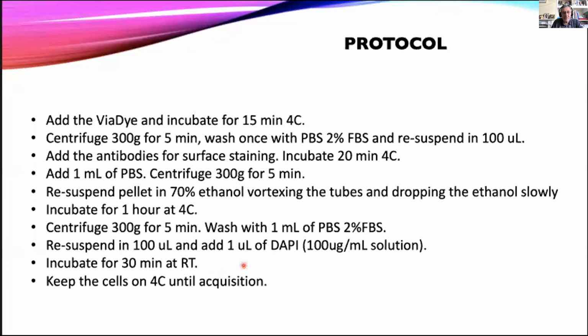So there's a question here about what's the minimum amount of paraformaldehyde or formaldehyde that can be used to fix cells. Well, I think it does depend on the cells and the cell type you're using. I'd normally recommend somewhere between 0.5 and 4% formaldehyde. Obviously, the higher the concentration, the more fixed they tend to become, and the more autofluorescent they become as well. So for most cell types, I would probably start off at around 1% formaldehyde. And if that doesn't look right, I move either side of that and try that experiment again. It may be a little bit of trial and error.